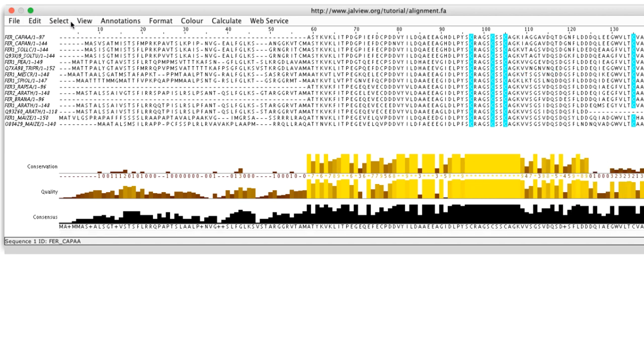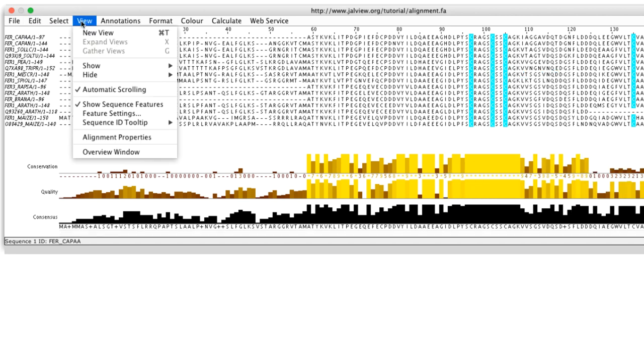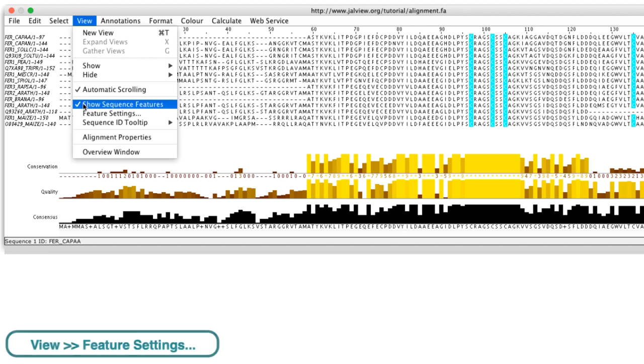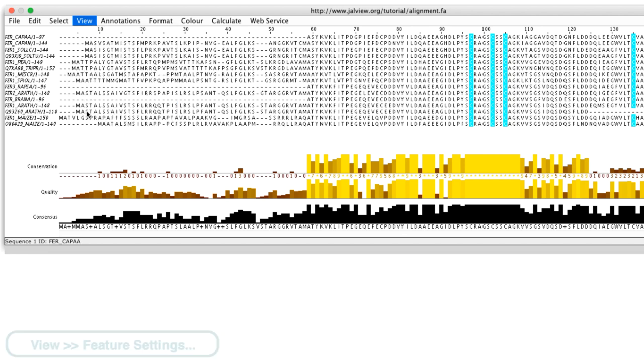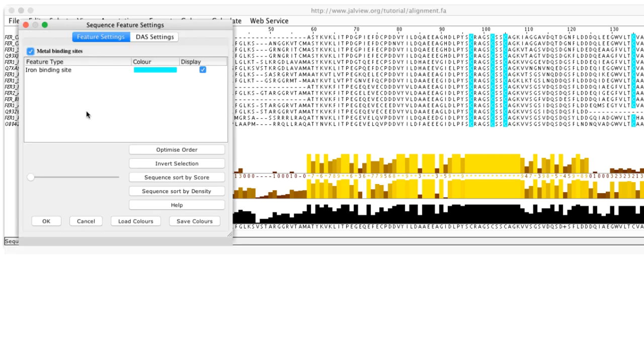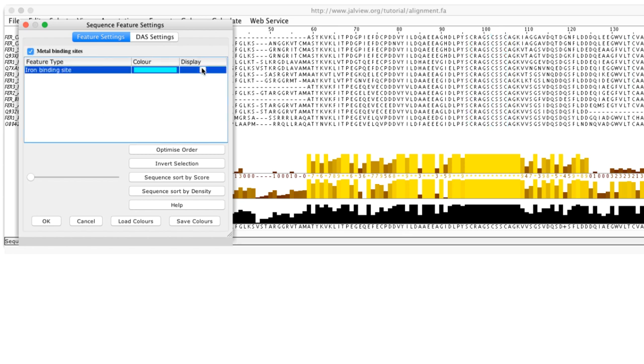If I go to the view menu in the alignment window and select feature settings, the sequence feature settings window will appear. This contains the feature I have just created. If I uncheck the checkbox for iron binding, the feature is no longer visible on the alignment. Checking the box will display the feature again.